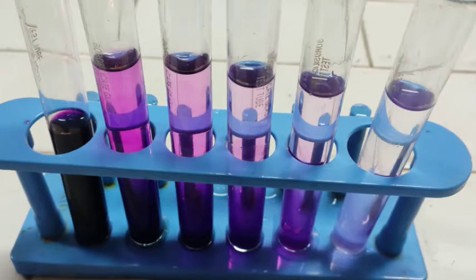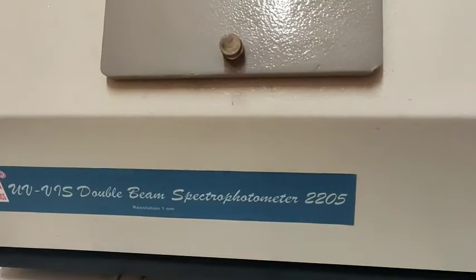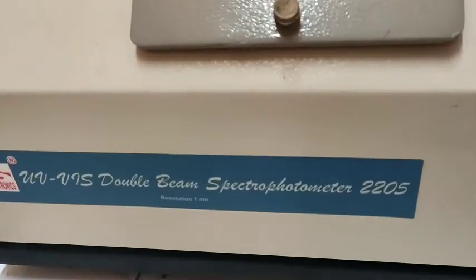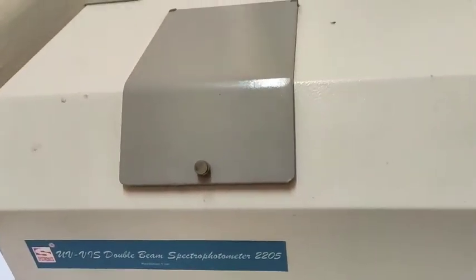Then we will add water to all these test tubes, and you can see easily that five different test tubes have five different concentrations of solution. Now this is our spectrophotometer — UV-visible double beam spectrophotometer, model number 2205. What we can see here is a sample chamber.